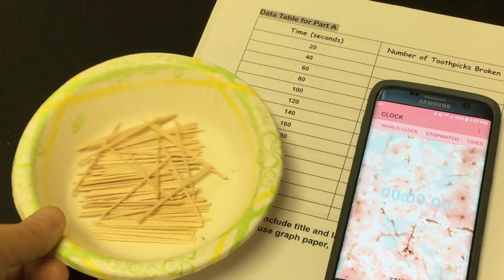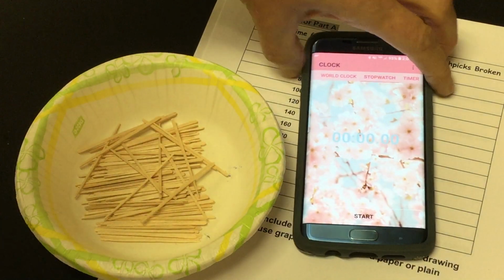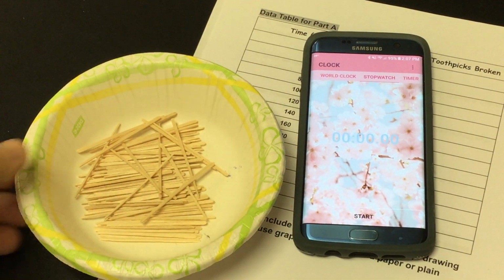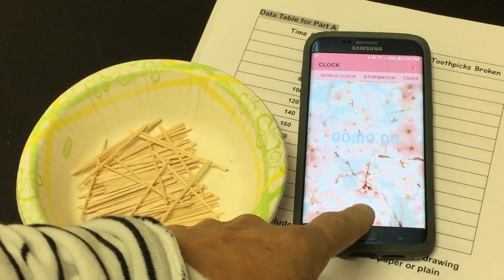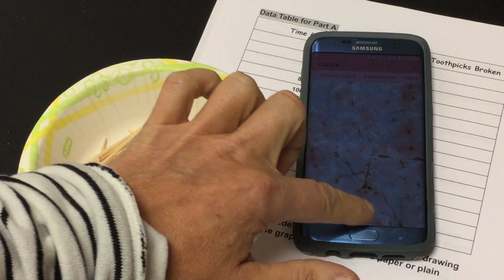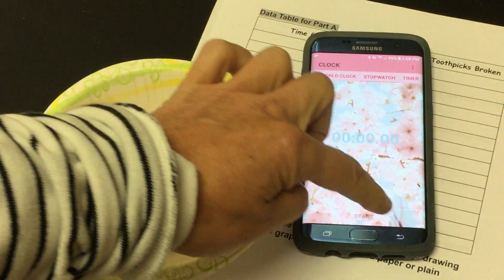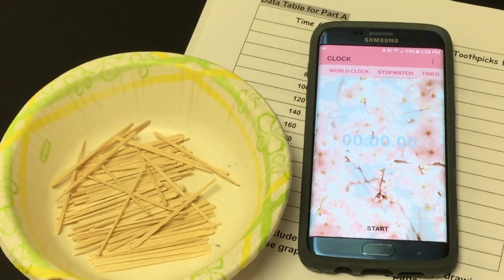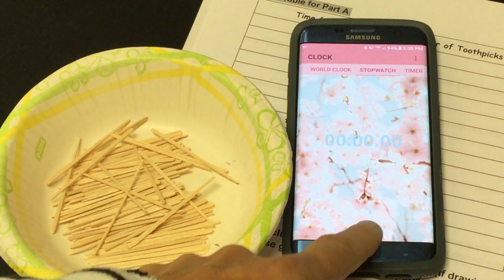There are my substrates. And like I said, every 20 seconds that you see on here, you want to go through and mark the number that I'm saying aloud. I'll keep a count all the way through. So here we go. One enzyme per substrate, one at a time. Keep them in there. I'm going to restart that because I didn't like how that started. And we are going to see if I can get you a little closer. And we're going to start.